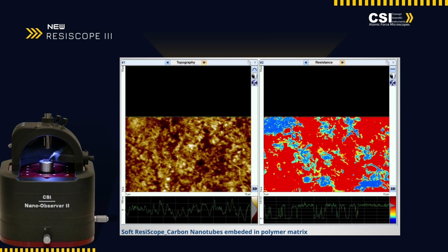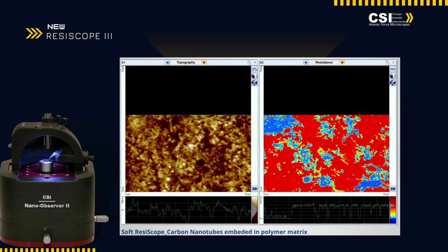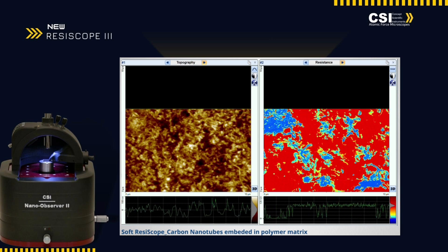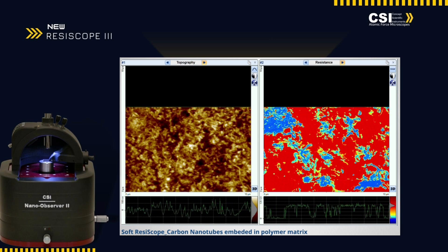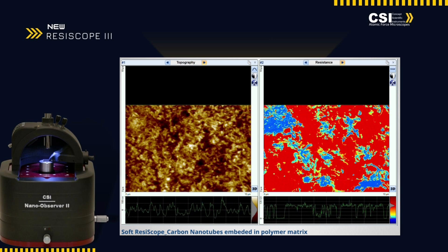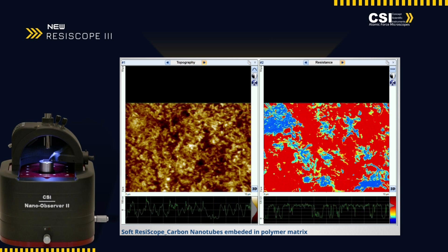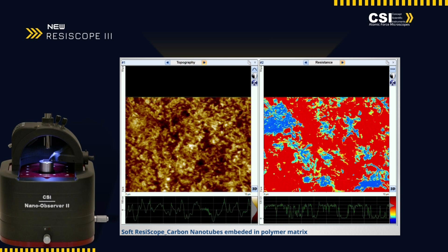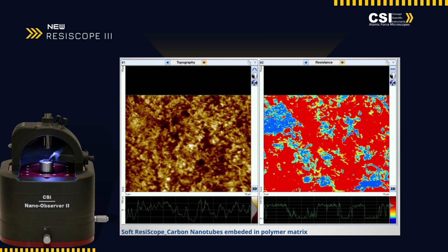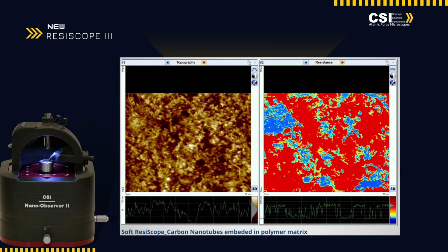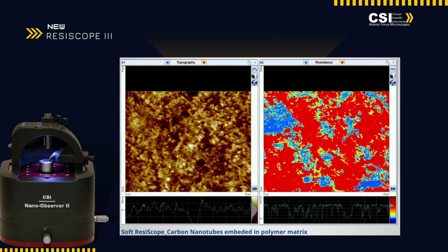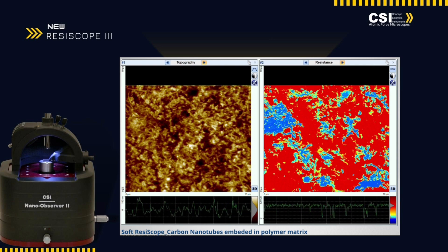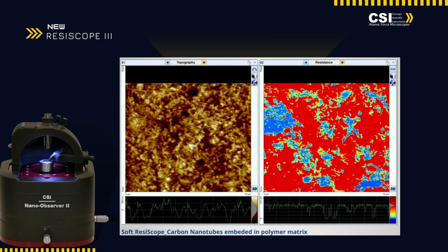This composite material, critical for enhancing both mechanical and electrical properties, is showcased through precise scans that reveal the uniform distribution and integration of nanotubes, demonstrating their pivotal role in boosting conductivity and structural resilience.